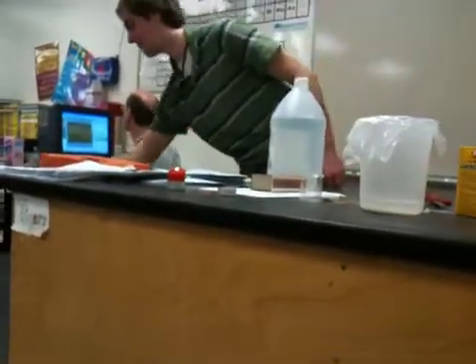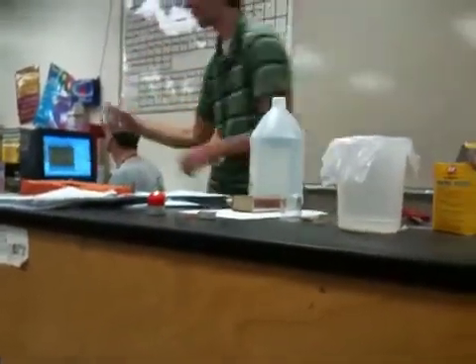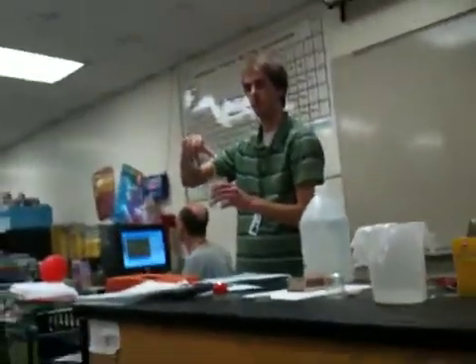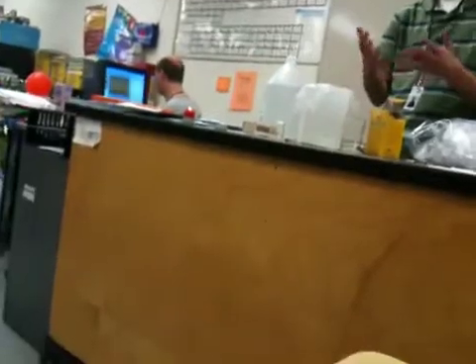We have liquid water, right? So this is able to flow. I can pour it from one beaker to another. It pours pretty easily, right? Liquids are slightly different than gases, but they're still able to move. The particles are able to move back and forth, versus a solid where they're stuck together and can't flow.